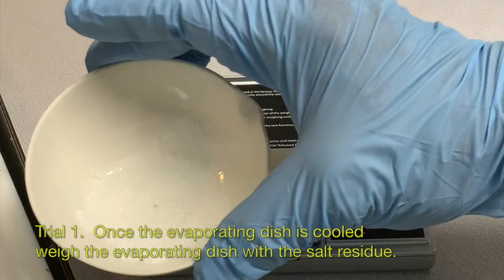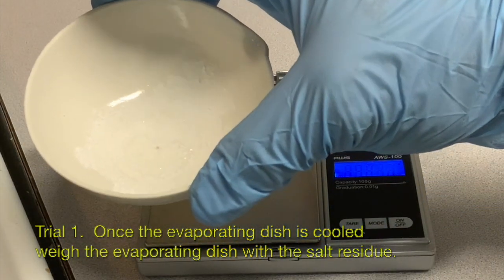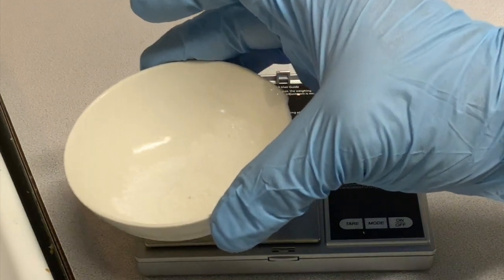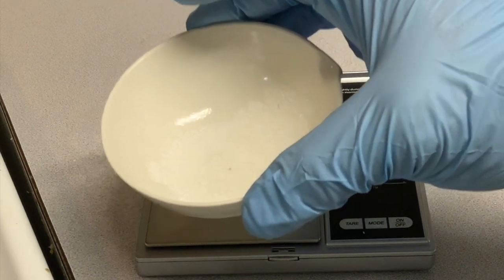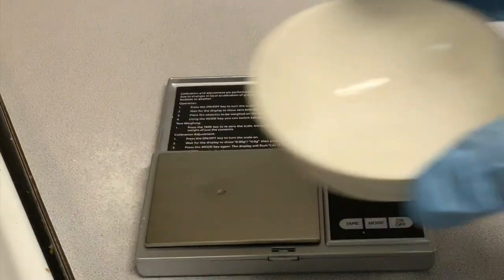What you need to do is clean the evaporating dish. The residue here is just plain salt, table salt. So you can go ahead and dump it in the sink with water. So I'm going to clean the evaporating dish and then dry it.